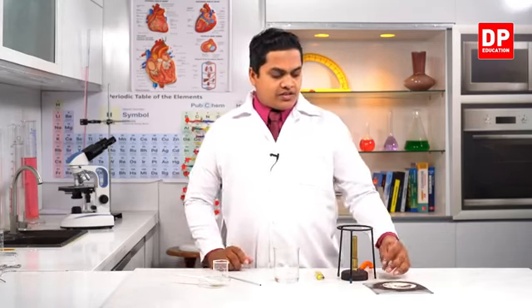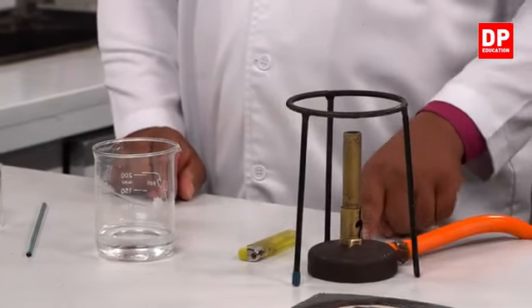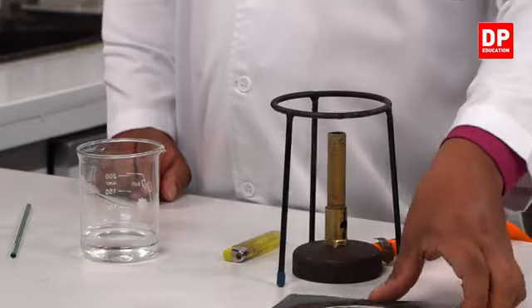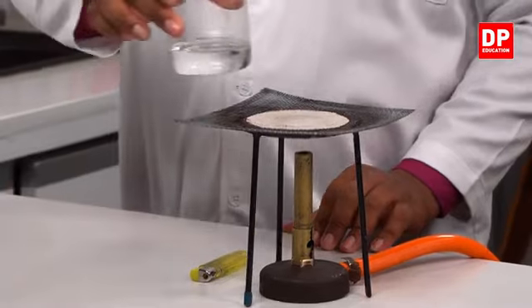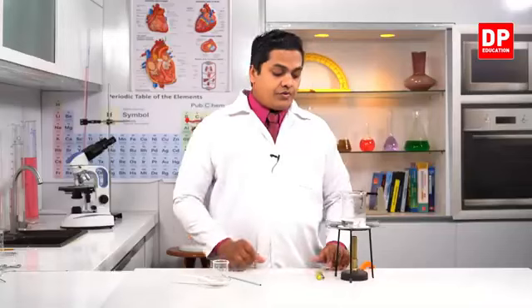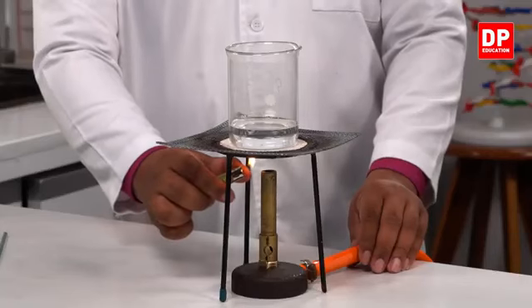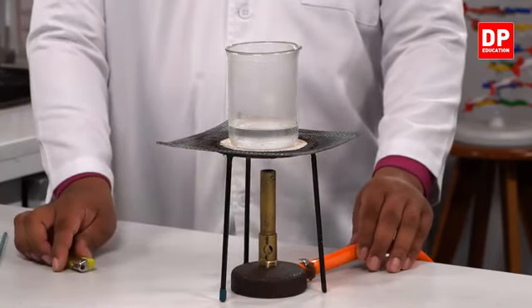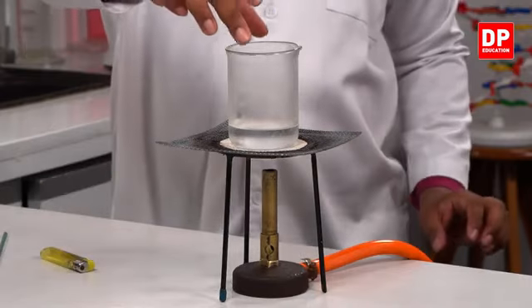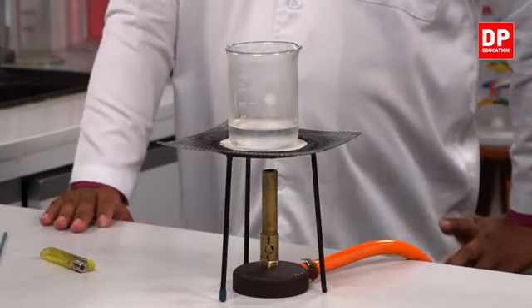after vaporizing the water. So now what I'm going to do is use this tripod and place it on the Bunsen burner like this. This is the Bunsen burner, and the steel mesh to hold the beaker. Now I'm going to light up the Bunsen burner and heat it. Right. So now I am heating the beaker very well.